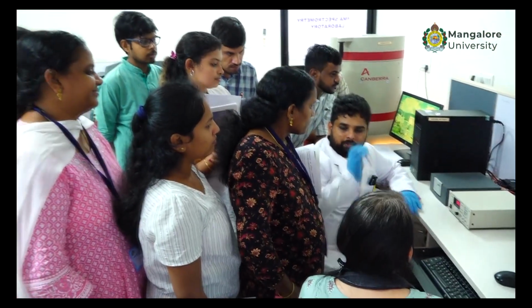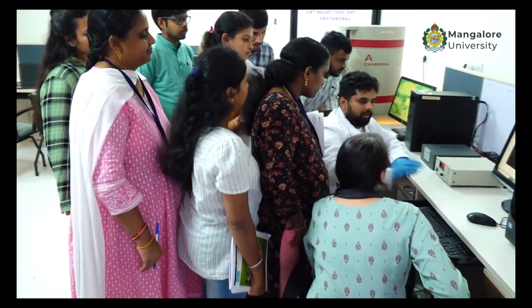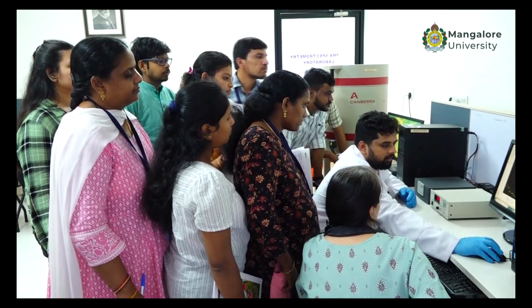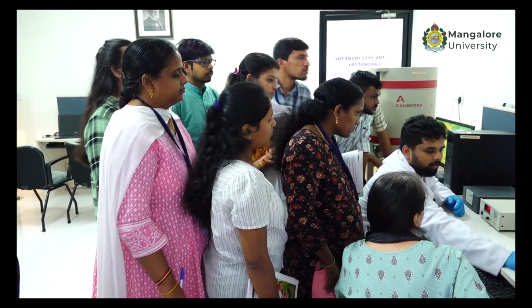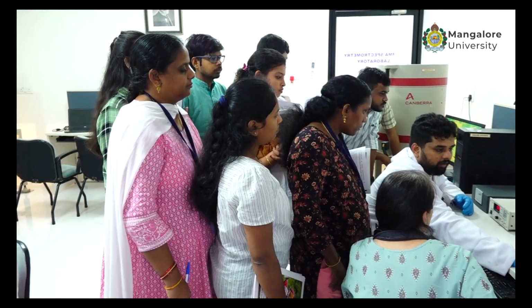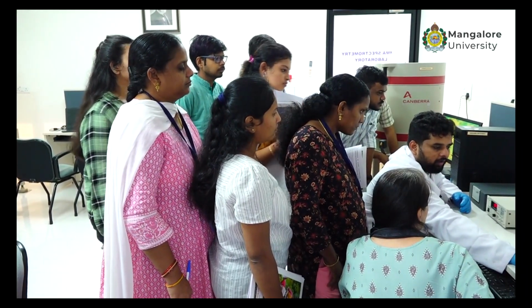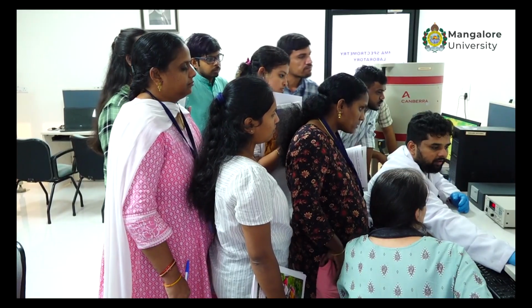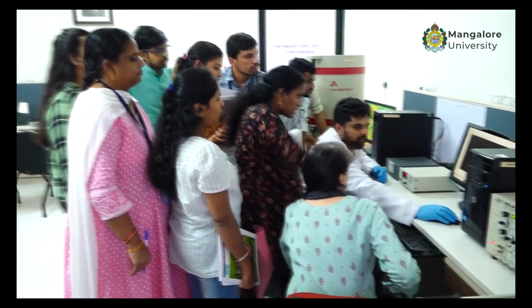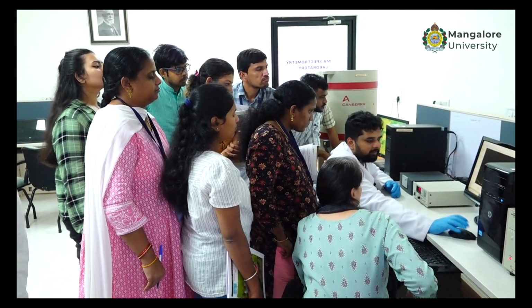So this point I think it is very clear now. So we don't have to worry much about it. Yes? So here we have kept both the sources, cesium-137 and cobalt-60. So you can see all three peaks and also a coincidence peak of cobalt. Okay? That is this one, no? I hope this much is clear.